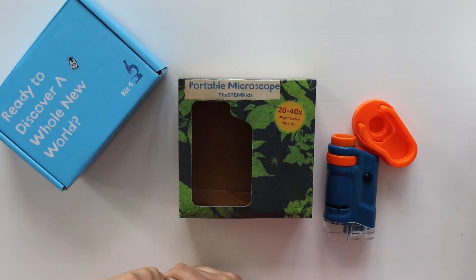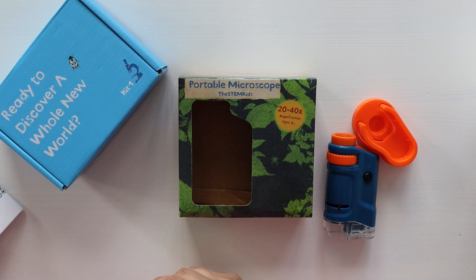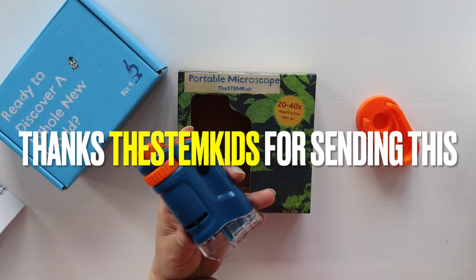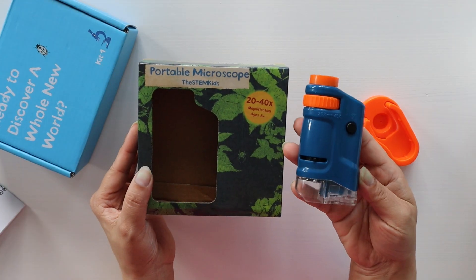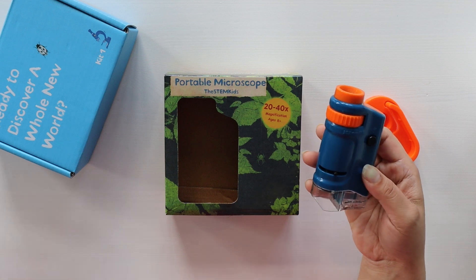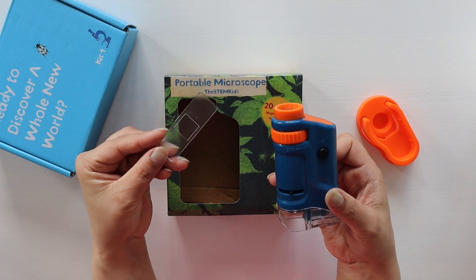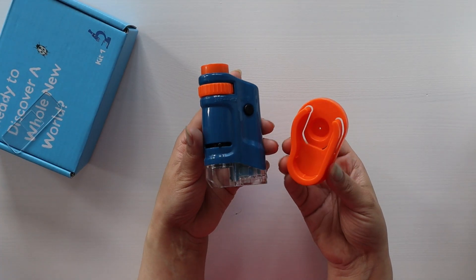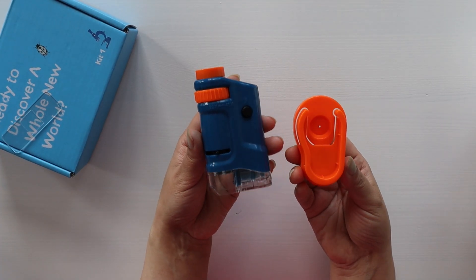Hey guys, welcome back to our YouTube channel. I hope you all are doing well. In today's video, I'm going to share this portable microscope with you. It came inside this box along with an instruction manual and one slide where you can keep your sample. As you can see, this microscope has two parts.